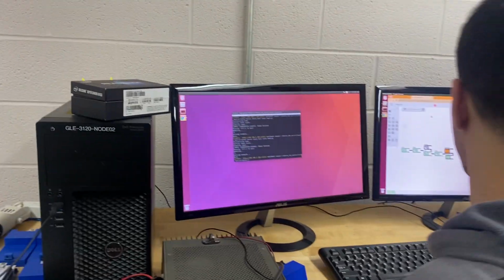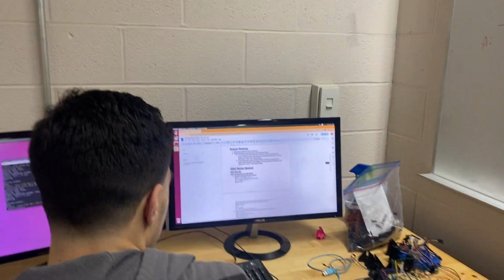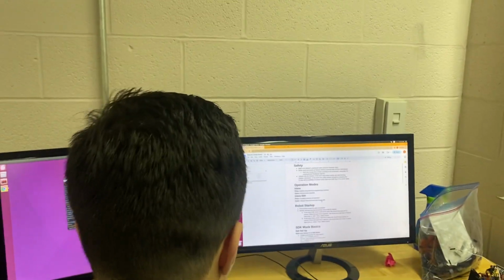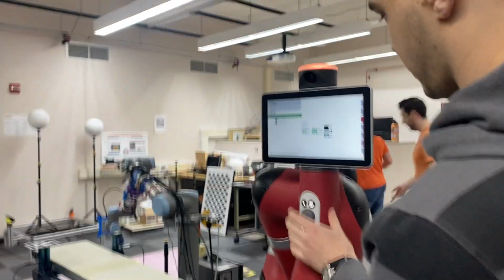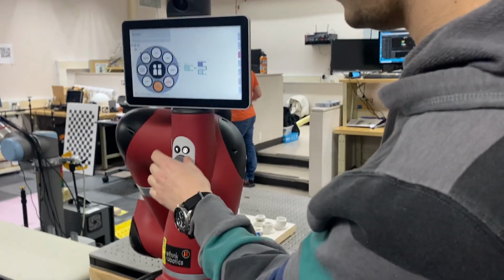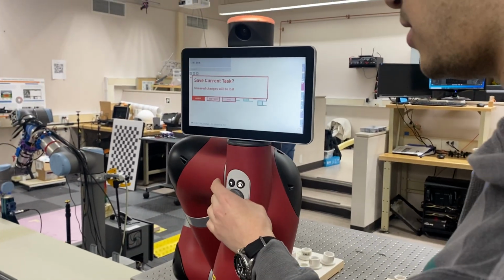Okay, now we're gonna go over how to get between your two operation modes. So I'm just gonna power it off. Fun thing about Intera mode at least is you can actually just power it off from this menu. System, Power.